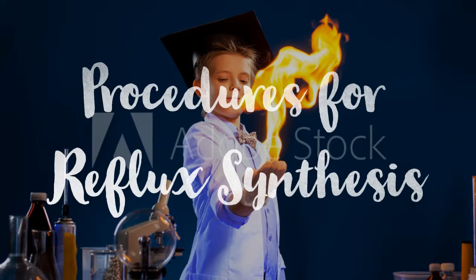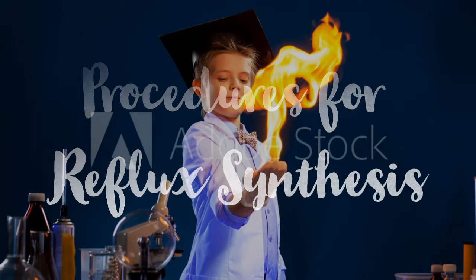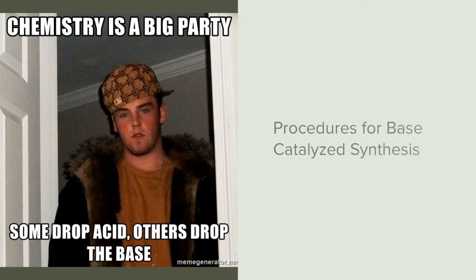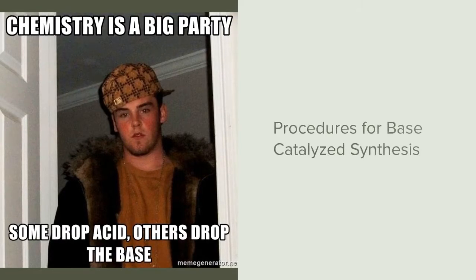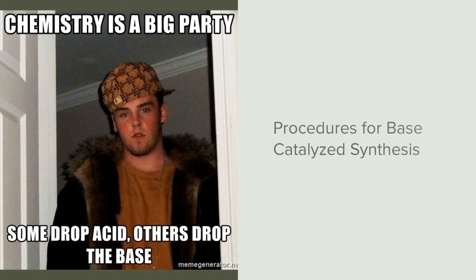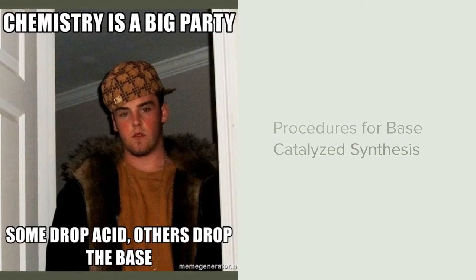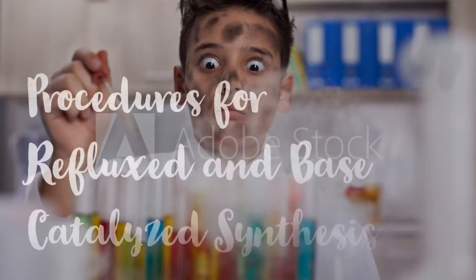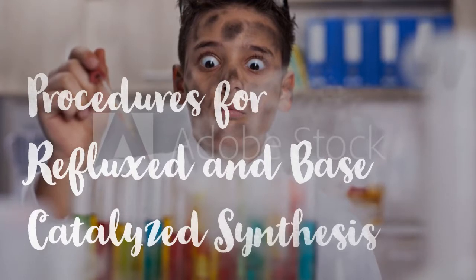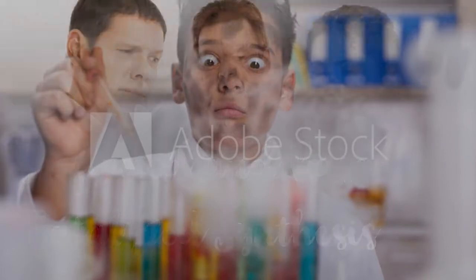worked up with a series of mixing and extraction with water, sodium chloride, and sodium bicarbonate, followed with addition and filtering of magnesium sulfate. The design for the synthesis with a base catalyst similarly followed the procedure to the ones for the synthesis at reflux. The solution of benzyl alcohol and acetic anhydride was not put on reflux, but had 10 drops of sodium carbonate added to it. The same procedures were followed for the synthesis that underwent reflux and had the base catalyst sodium carbonate added to its starting solution. Reflux was, however, done for 15 minutes.